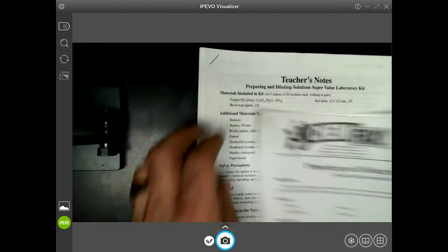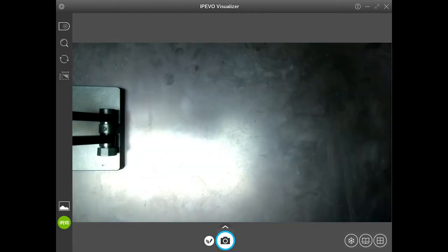So let me actually get one of the same ones that have the same stuff that you guys have on it. Okay.